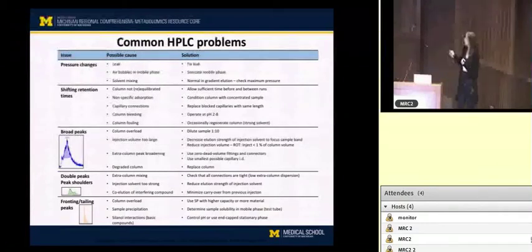And that causes this ugly unintended peak shape here. And there are several ways to get around that. So either use a lower pH that keeps the OH groups from being dissociated, or use end-capped stationary phases. Definitely every manufacturer provides them.